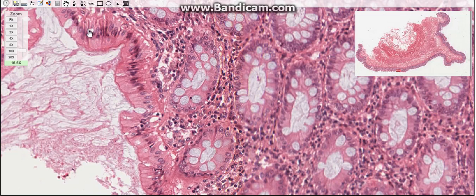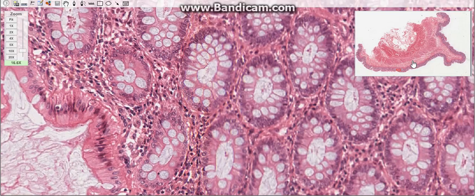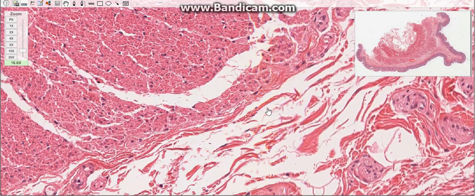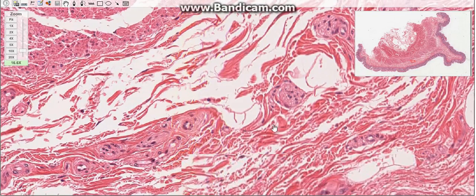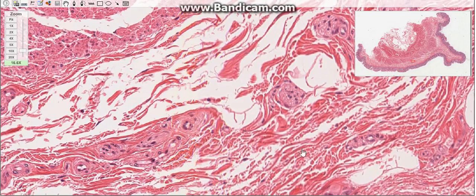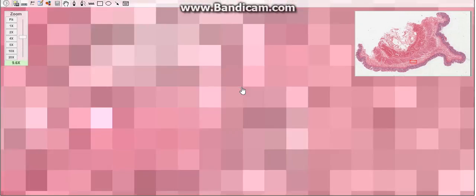The second layer is the submucosa, which consists of loose connective tissue. It is rich in lymphoid follicles, also called lymphoid nodules.